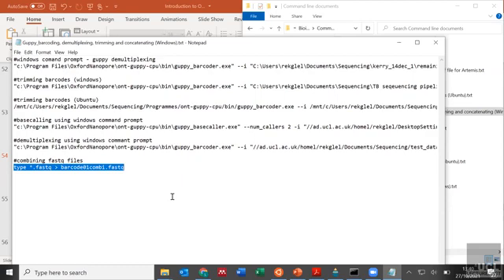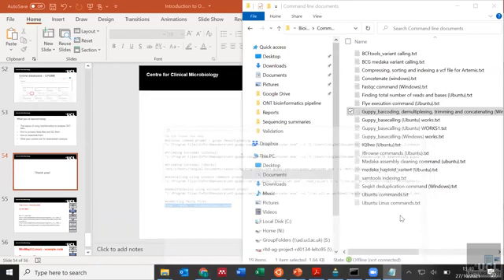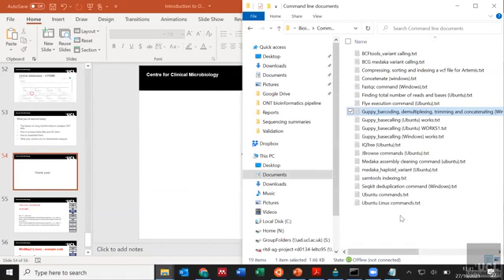Yeah, very good. Great. I have a bash script which I can provide you for Illumina to do this. That's amazing. That's a great gift. Because the problem with Illumina is that you have 96 samples. Each of them may be in 2 or, depending on the platform you are using, up to 8 files per sample. So it's automated, and at the end it names the file with the same sample name as you have put in the sequencing file name. That's perfect. That's what I have, I have 8 files for each sample. Yes. And, okay, that's really good. Thank you. I can provide this, don't worry.